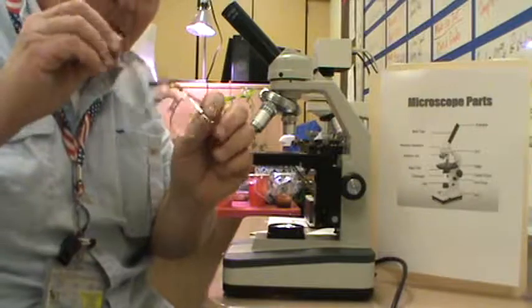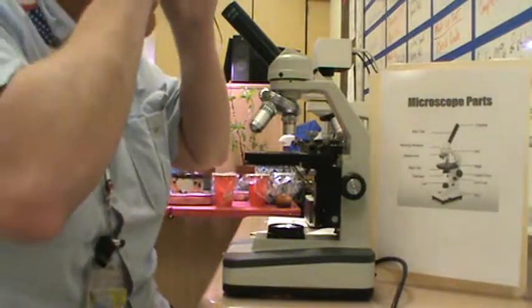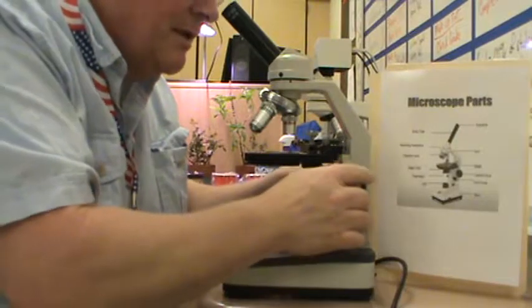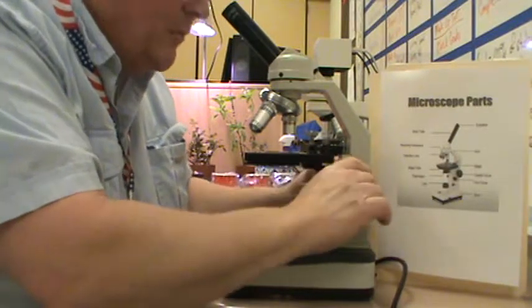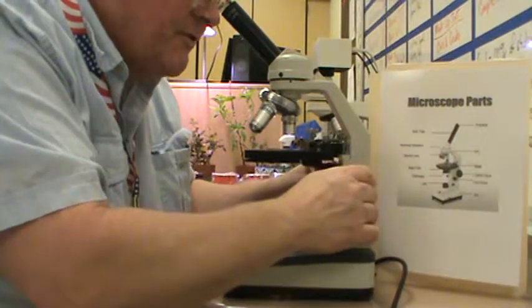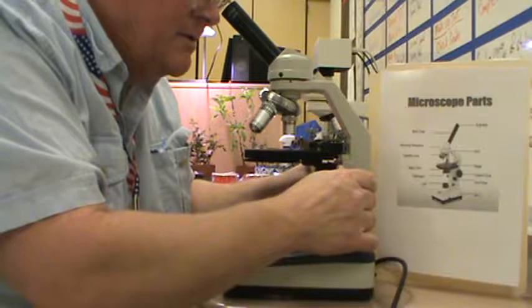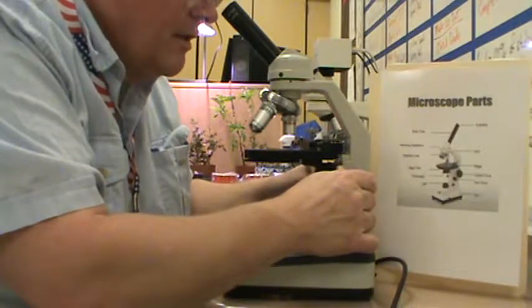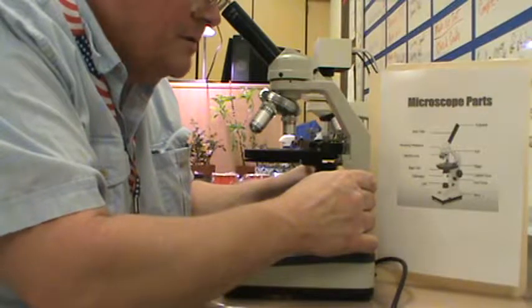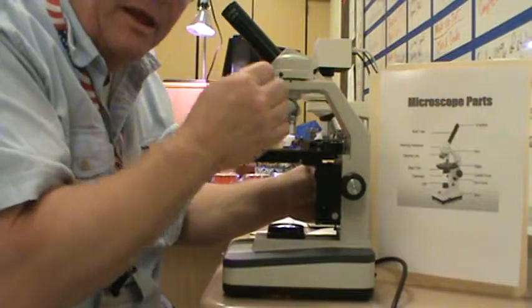Now, if you have glasses like I do, you can use your glasses. What I would do here is I would come up to right about there without the lens touching. Then I'm going to start doing my coarse focus, coarse adjustment. There I see it. Now you'll notice that my face is not up against the eyepiece. The way this works, the best viewing is with your eye just off the eyepiece.